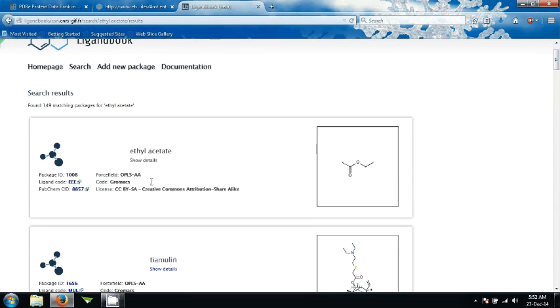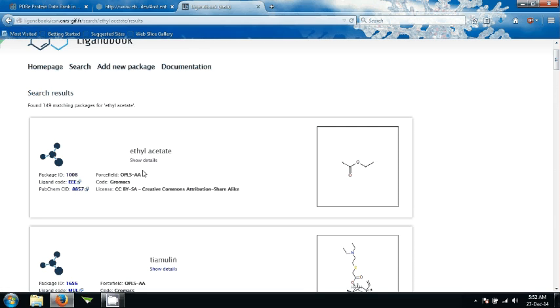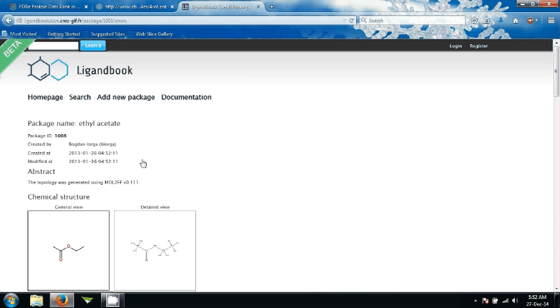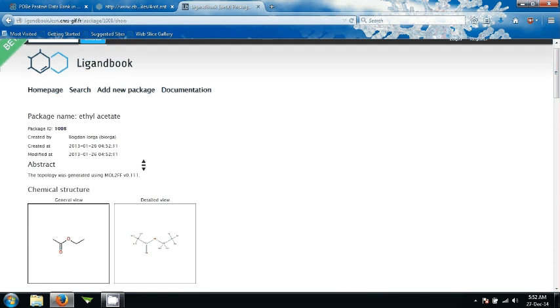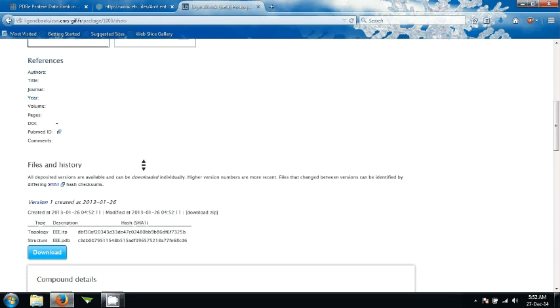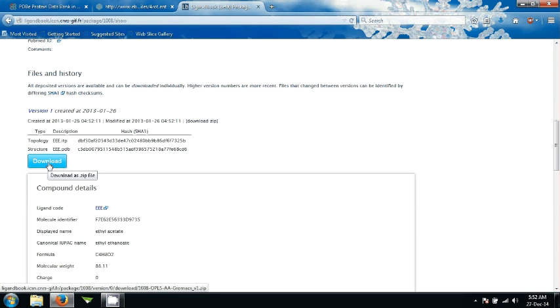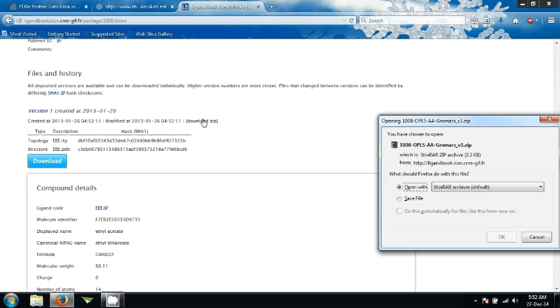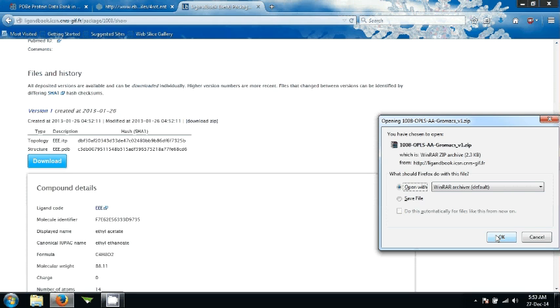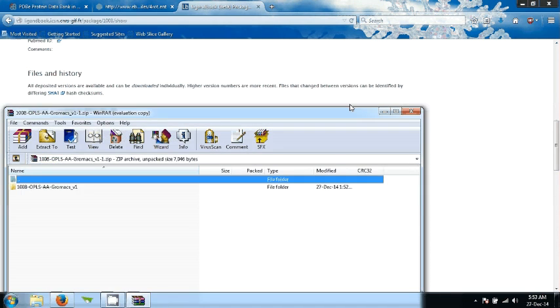Either you can use this package ID which is not recommended because most often it returns with error on PatchDock. What you need to do is just click on show details. Scroll down and either click on this download zip or click on this download. I will just click this one. This says that open with. You don't need to save it because the PDB file is inside this zip. We need to extract that. Go ahead then click on OK. This file is opened up.